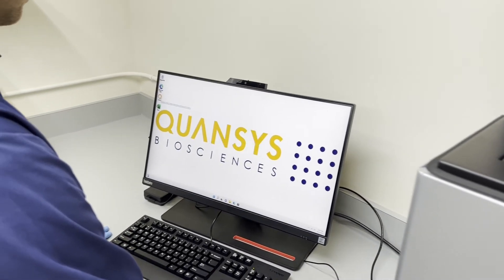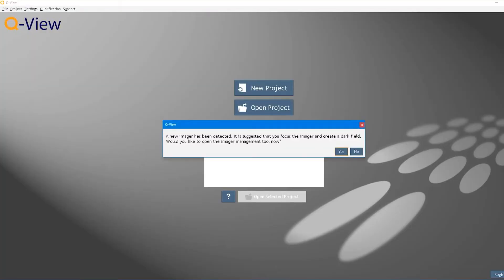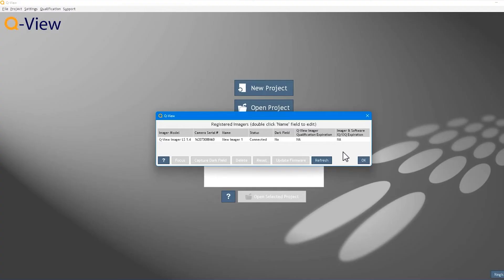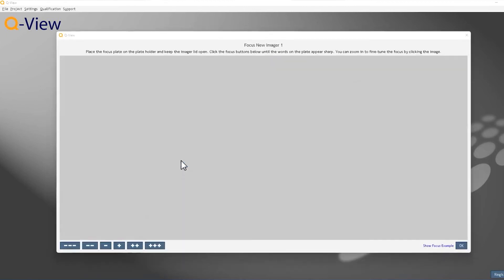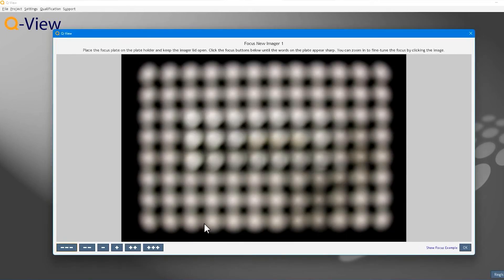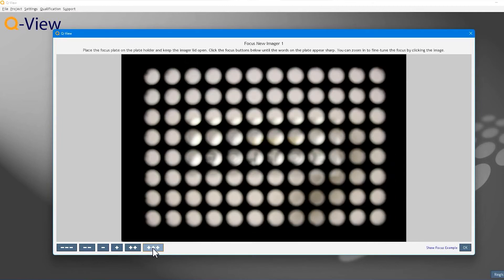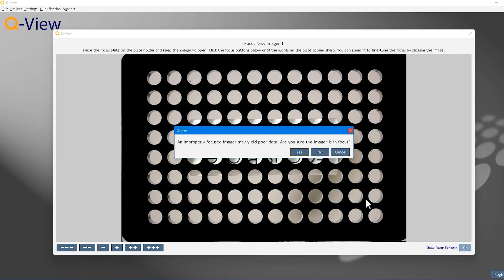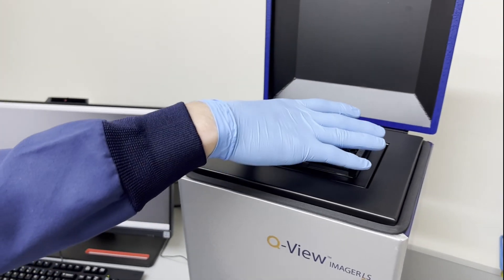Once QView software is installed, open the application. The software will automatically recognize the imager and will prompt you to focus it and create a dark field. Click Yes to open the imager management tool. To focus the imager, place the focus plate onto the glass insert and leave the lid open. In the QView software, in the Manage Imagers window, select the imager and click the Focus button. Click the plus and minus buttons to adjust the focus as necessary. Complete the process by clicking OK, then remove the plate and close the lid.